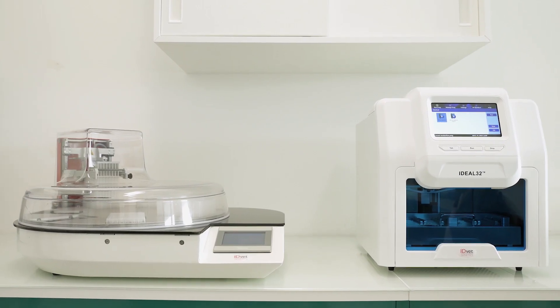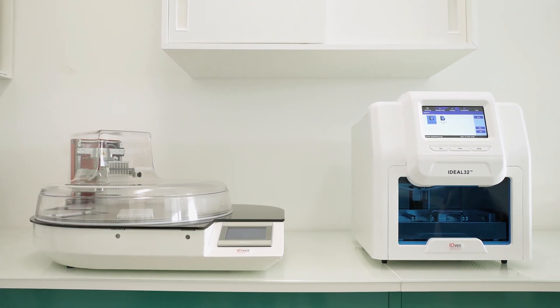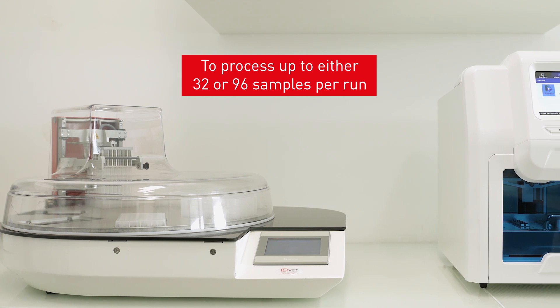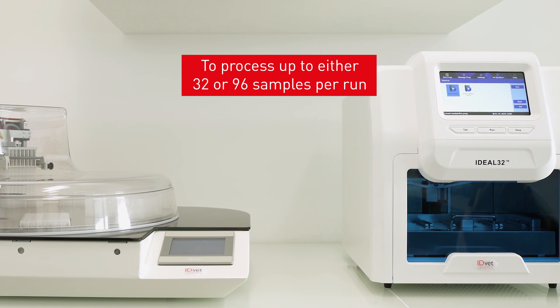We are pleased to present our range of Ideal robots for the automated extraction of DNA or RNA. These robots use magnetic bead technology to process up to 32 or 96 samples per run.